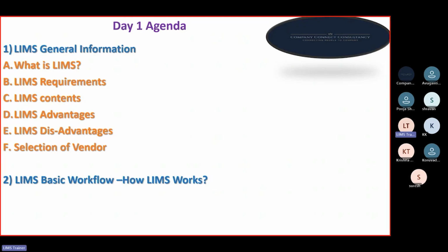So let's say in a laboratory, they don't have LIMS right now. They are just working manually, and they want to go for digitalization using the LIMS. Okay. So now they have decided to implement the LIMS software into their laboratories. They will approach the vendors out there in the market and select a vendor. Let's suppose they selected Labware. Okay, so Labware is the vendor for the LIMS.